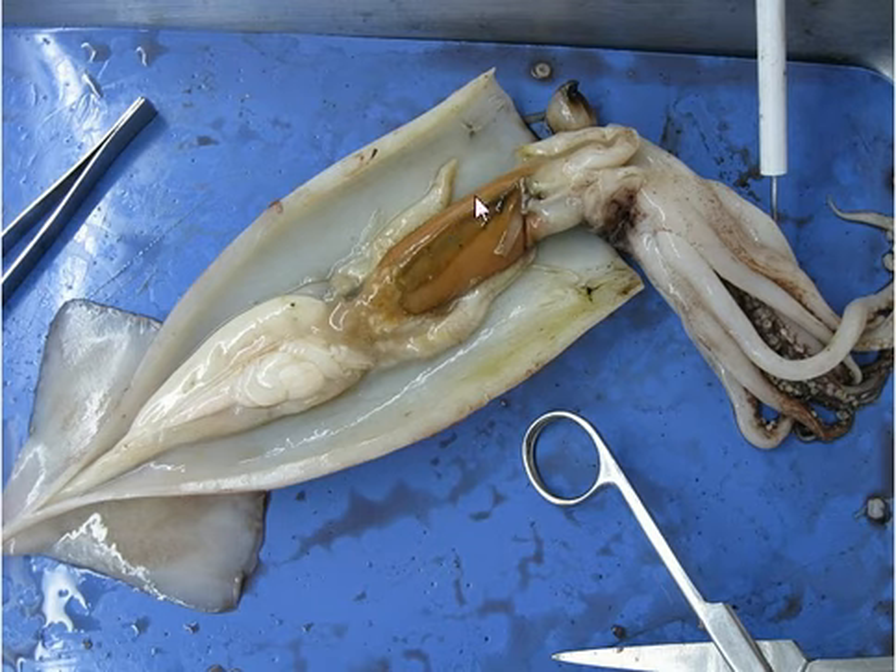The liver is reddish-orange. The water jet is around here, I think. The esophagus — I already took it out, but you can't really see it. This is the beak, and the esophagus follows from here, but right now it's covered. Anyway, that's the esophagus.